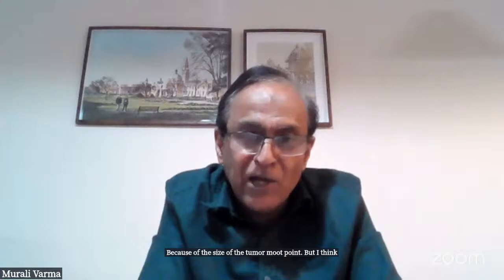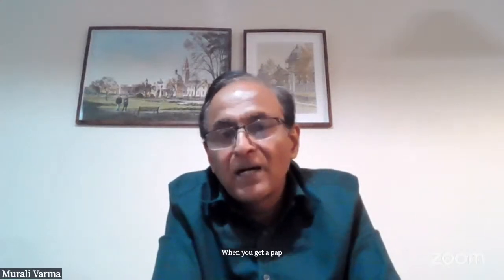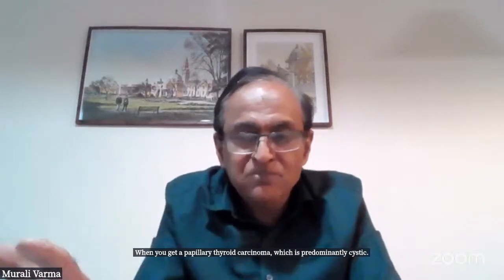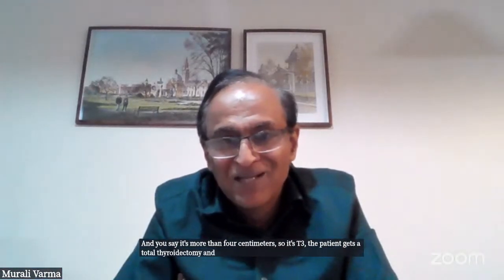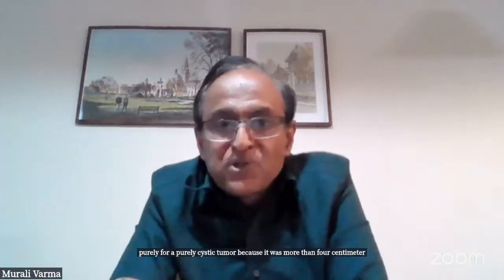Moot point. But this becomes more important in the thyroid. When you get a papillary thyroid carcinoma which is predominantly cystic, and you say it's more than 4 centimeters, so it's T3, the patient gets a total thyroidectomy and thyroxine replacement for life, purely for a purely cystic tumor, purely because it was more than 4 centimeters. I think there it becomes a real problem.